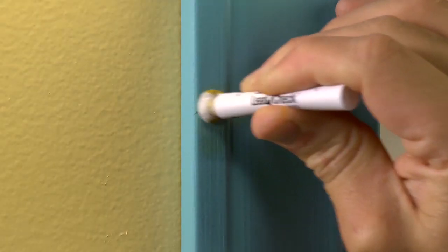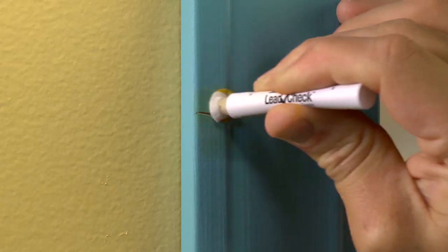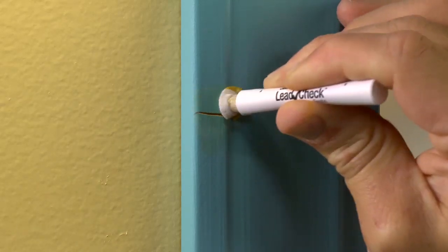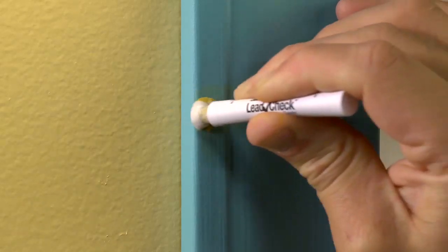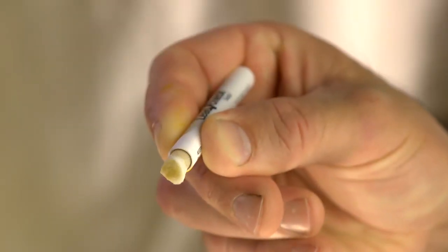If not, rub the area until color develops, but not longer than 30 seconds. If the swab and surface remain unchanged after 30 seconds, lead has not been detected.